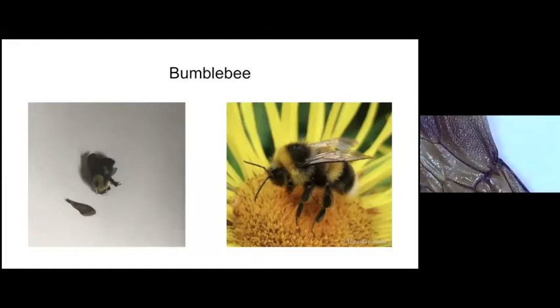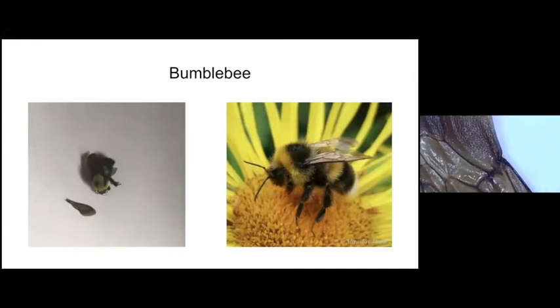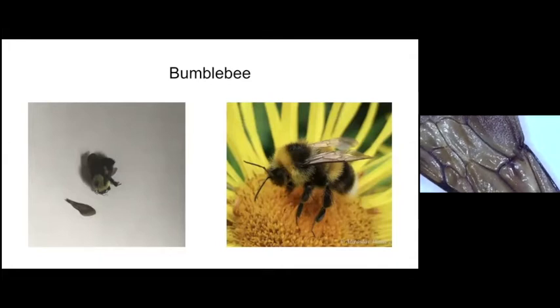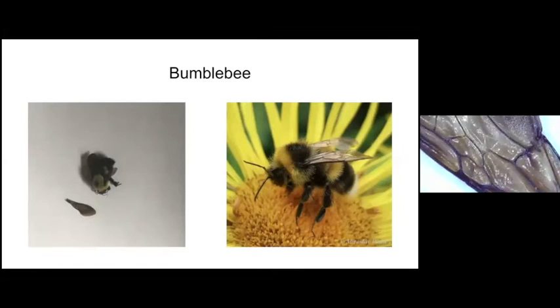But yeah, so this is the wing from a bee, and now that we see the macro image, what do you guys think the wings help the bee do? Can you make any inferences about that? Fly. Yeah. They help it fly. Yeah. Do you think they help it get food from like one flower to the next?